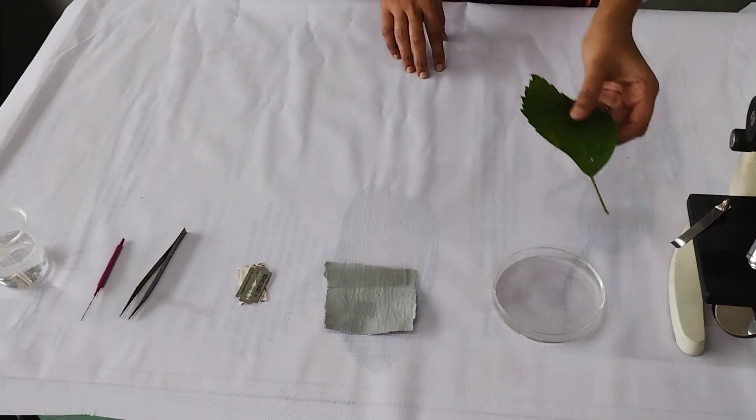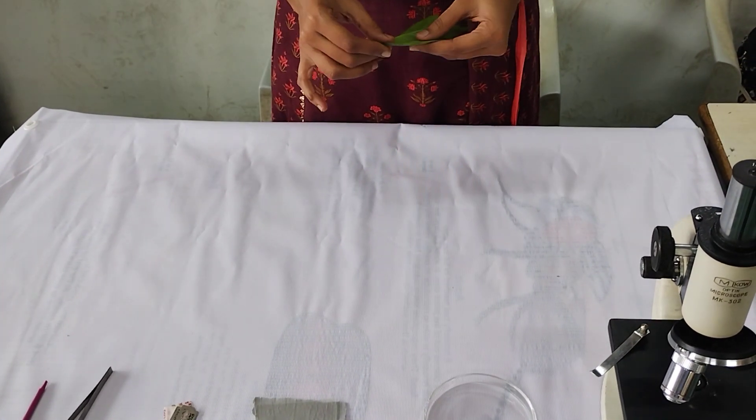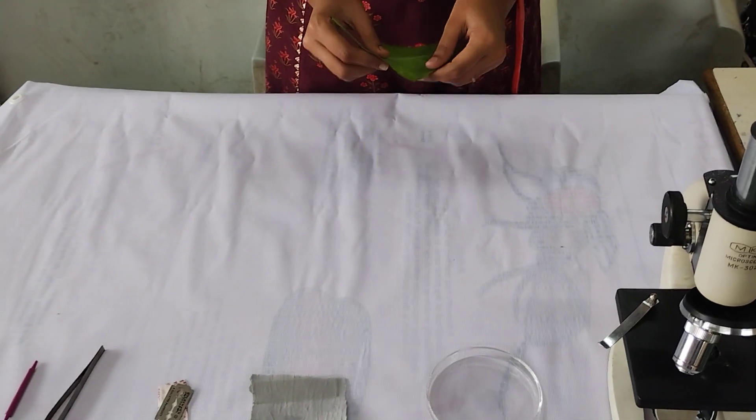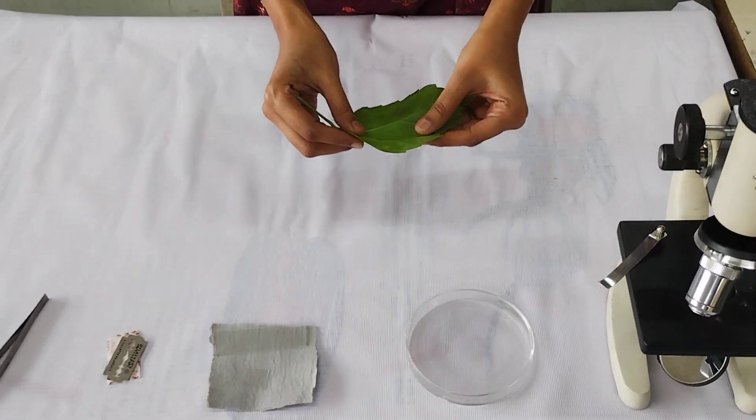First of all, we have to take the dichot leaf and we have to take the epidermis, that is lower epidermis of this leaf, to observe the structure and distribution of stomata.